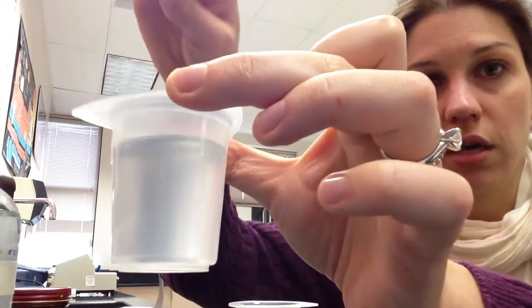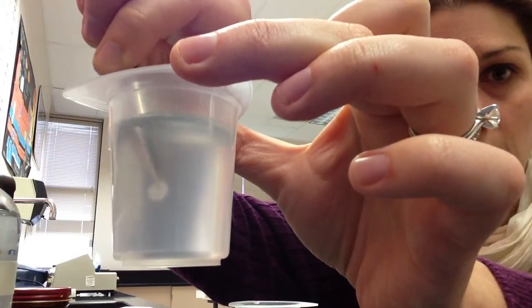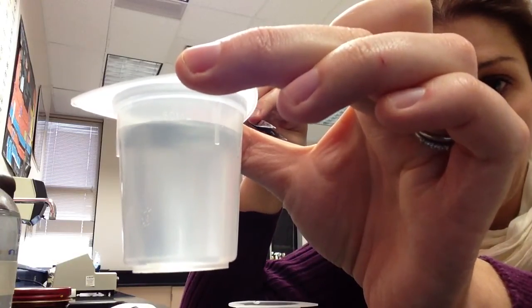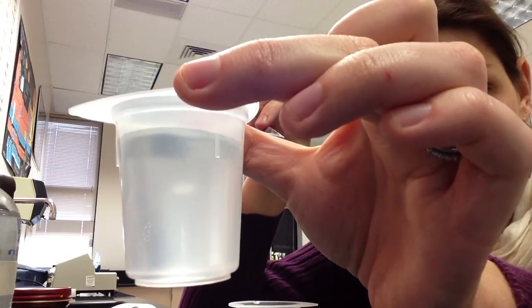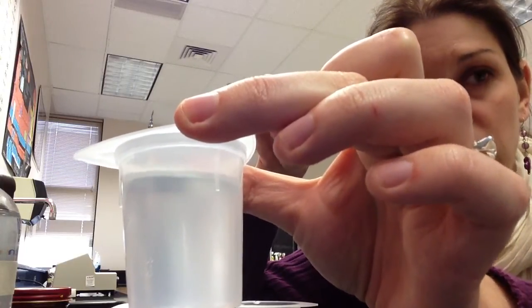So let me show you. I'm going to get it real nice and close. I am going to release this in the middle. If it sticks, just shake. And it sunk to the bottom, and that's okay. And then we just wait and wait and wait. And then as bubbles accumulate, and you probably won't be able to see the bubbles accumulate right at first. There it goes. It's going to go right back up to the surface. And so once it hits the surface, that's when you stop timing. And that is how long your reaction took.